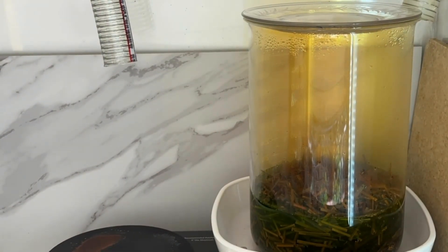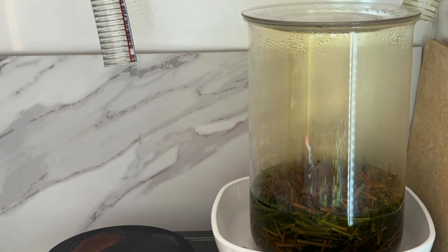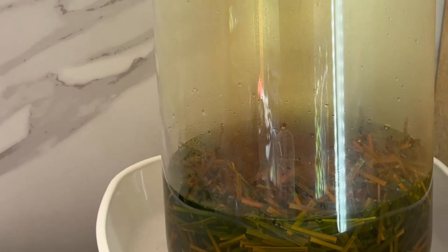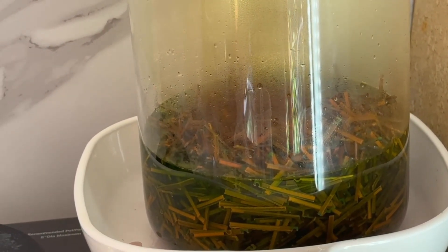The aqua regia is doing its job — the gold foils are disappearing in front of our eyes. It looks like it's pretty close to done. We have a lot of empty sticks and a little bit of fume, so we probably have some excess nitric in there still, but you can see there's no gold left to be seen. It's all been dissolved into aqua regia.